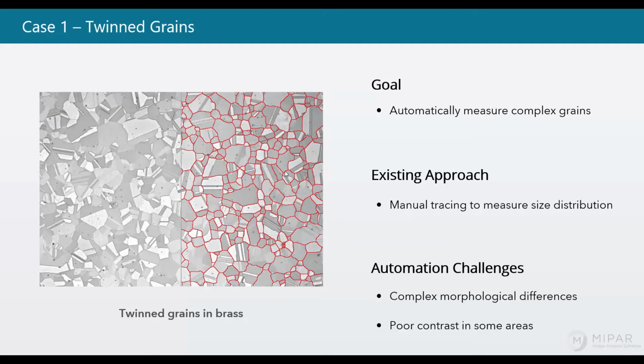So historically, this has been done purely manually. If you're just looking for a mean grain size, folks will lay down a set of random lines and count off the intercepts and get a mean size that way. This particular client needed a full size distribution, and even though going with EBSD would have been more unattended, the time cost and sample prep challenge involved caused them to just sit down and trace all these boundaries by hand so that they could get a full, grain per grain size distribution measured. We've talked about the challenges here.